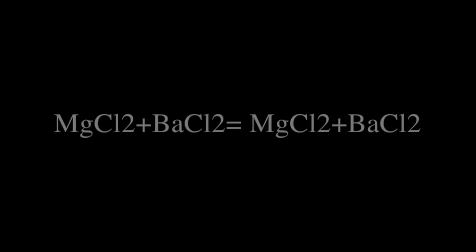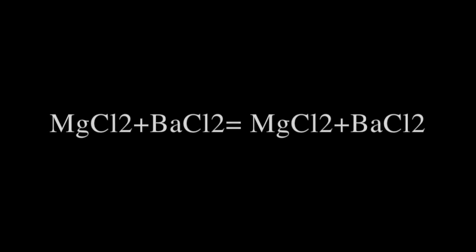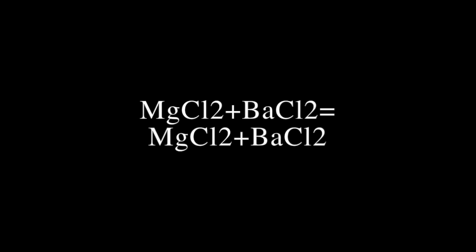In this practice, we try to understand when a compound is soluble or not in water. We understand that a compound is soluble in water when at least 1 gram of it is solubilized in 10 milliliters of water. The first thing we did was to put the different compounds on the table and see the reaction they formed.